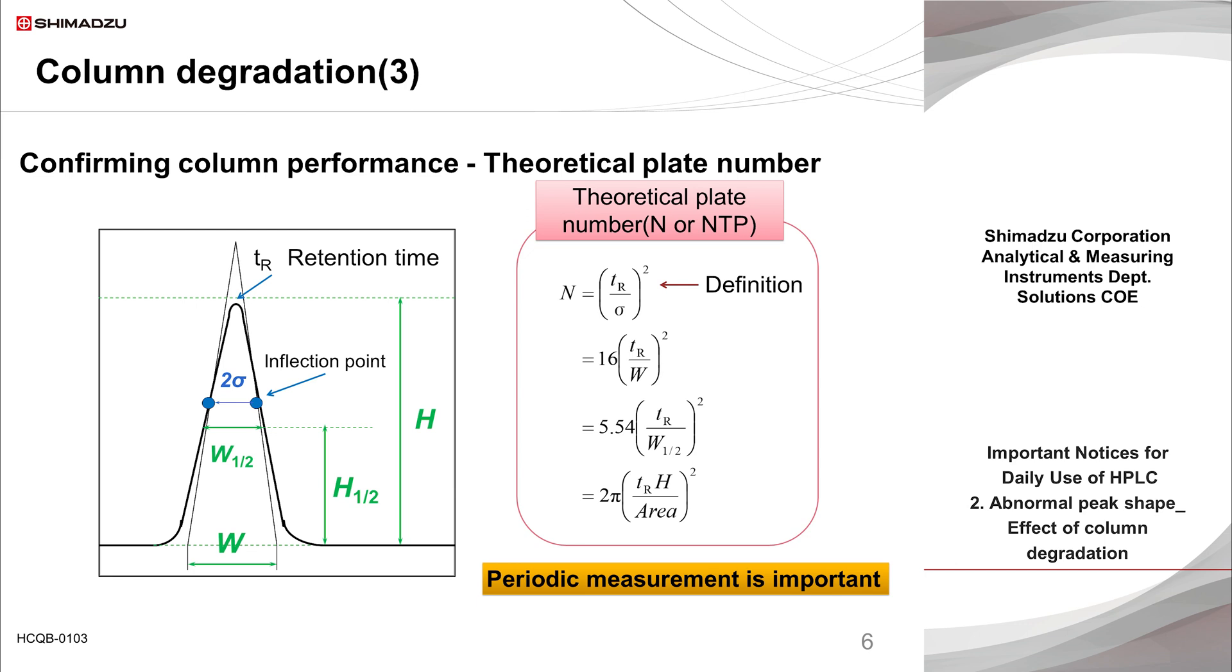Using the theoretical plate number allows for quantitative evaluation of the column performance. For example, a measurement of 10,000 plates for a caffeine peak under certain analytical conditions when the column is brand new, and 7,000 plates after one year of use shows a certain degree of degradation over time.